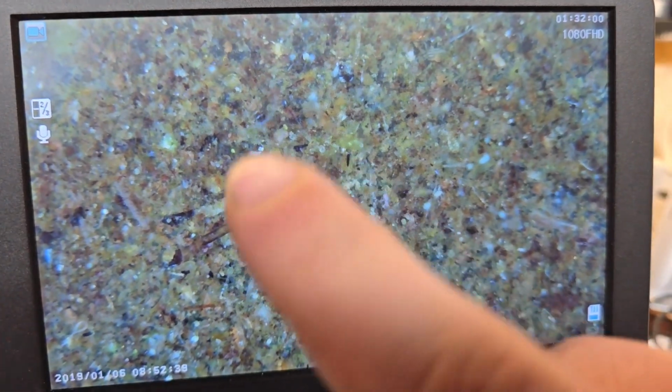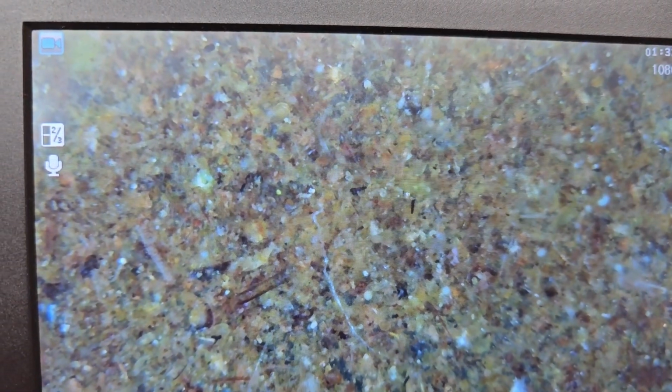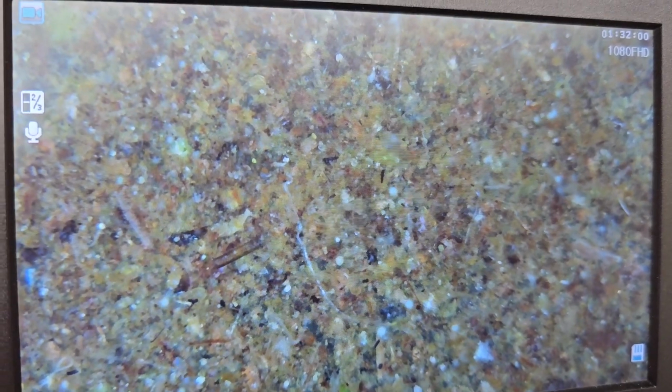So let's see if we can find any worms or anything, too, and then we'll wrap up the video. Well, there's a really big cluster of worms right here. Bada-ding, bada-ding, bada-ding. Look at those guys. They are so spastic. Little roundworm buddies, I guess. It could be nematodes. Yeah, they are just all throughout this stuff.